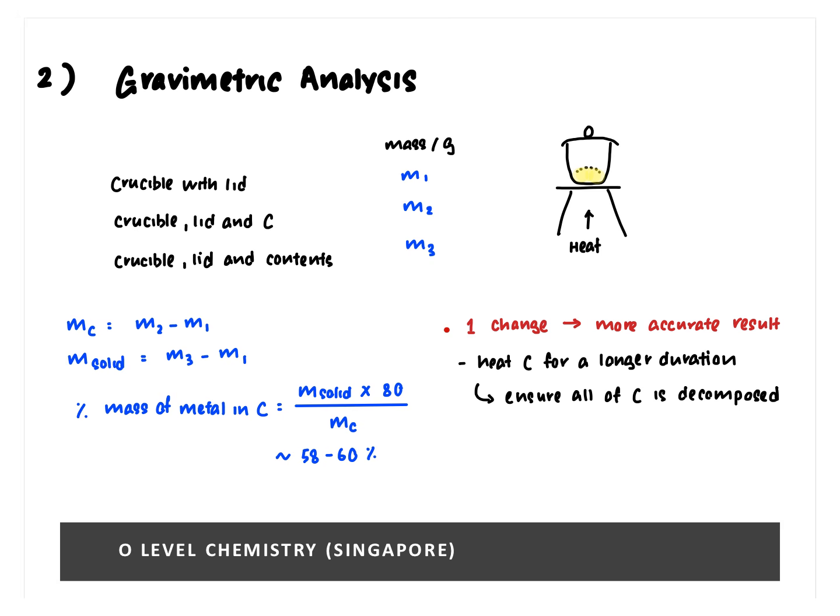Now, in practical lessons, we have learned that when you heat a solid strongly, we are actually trying to decompose the solid. And in our syllabus, in thermal decomposition and the reactivity series, we learned that metal carbonates decompose on heating to give you metal oxide plus carbon dioxide. Okay, so very likely we are looking at a metal carbonate as C. Then when you are heating the solid strongly, I'm sure you have noticed, this is quite obvious, the solid was initially white.